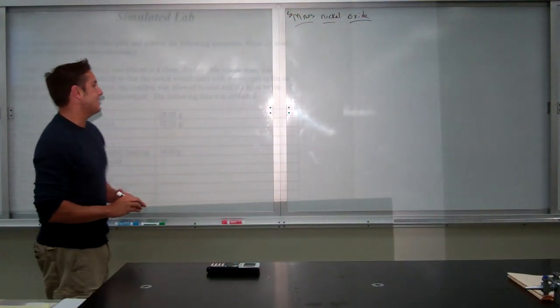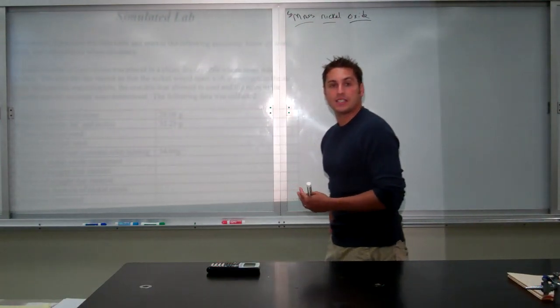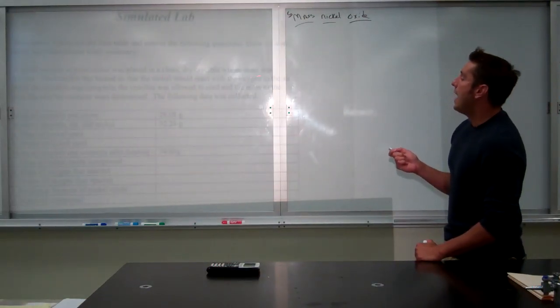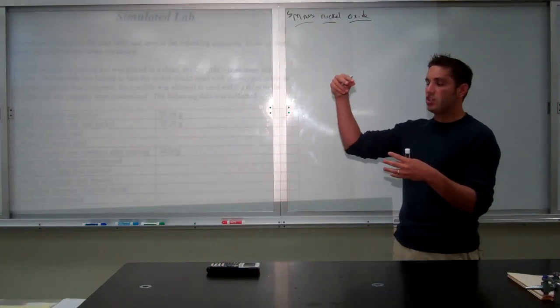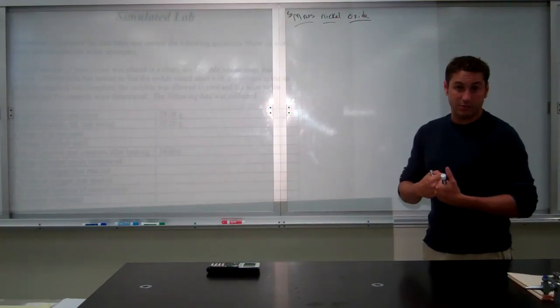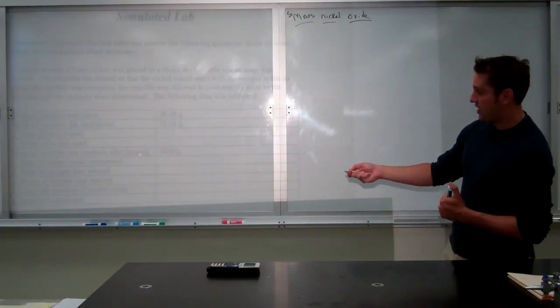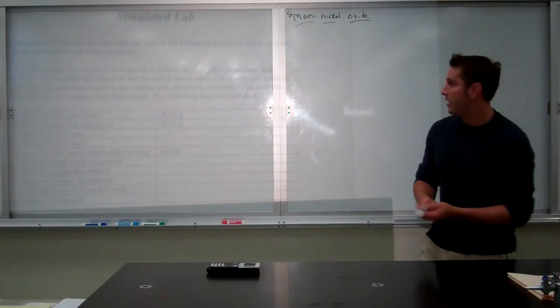So if I want the mass of the nickel oxide, the first thing you have to understand is where the nickel oxide is located. If we take a look in our experiment, it says that the crucible was heated with just nickel in it, and it reacted with oxygen from the air. So after the crucible was heated, oxygen from the air underwent a particular type of reaction called a synthesis reaction, that it bound to the nickel inside the crucible. So that's where the nickel oxide is after the heating. So the mass of the crucible and contents after heating is the nickel oxide.